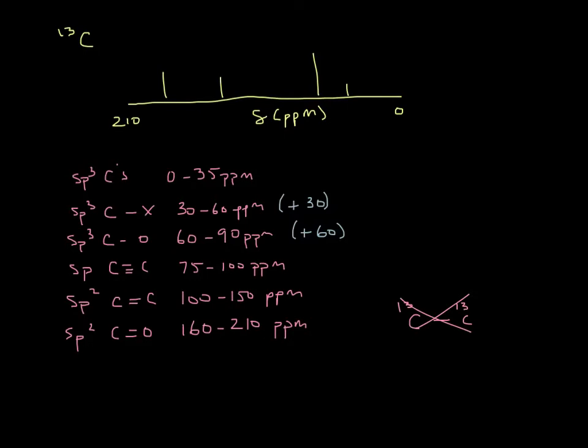So really the only things we worry about in carbon NMR are the number of environments and roughly where they are by chemical shift. So it's much less complicated. There's much less information in a carbon NMR than there is in a proton NMR. Furthermore, because carbon-13 is about 1% of all carbons, if you have a normal sample that you're putting into an NMR to look at those carbons, it's going to take a lot more time because you're not going to be able to see them as well, since there are just not as many of them in your sample. So whereas a proton NMR might take you a minute to run the sample, a carbon NMR is going to take hours. We're going to look at a couple of molecules here.